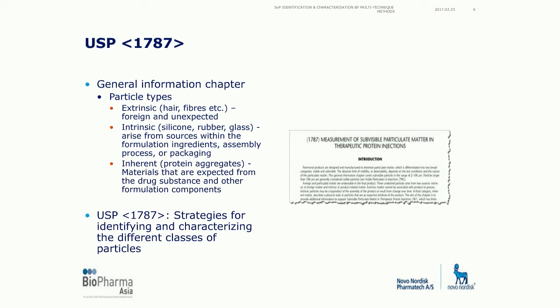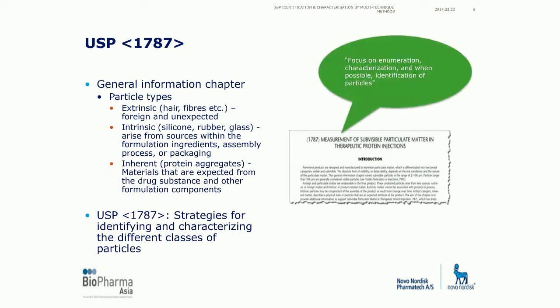As it stated, the chapter has focused on enumeration, characterization, and when possible, identification of particles. So we should, if possible, ID these particles.